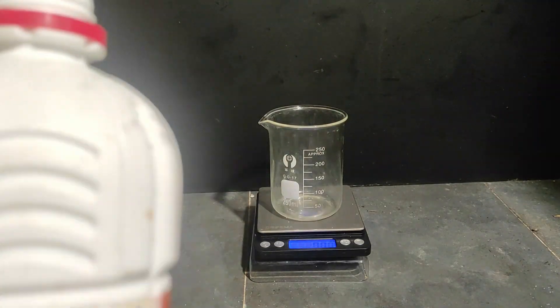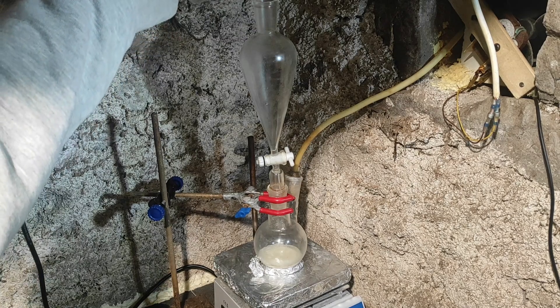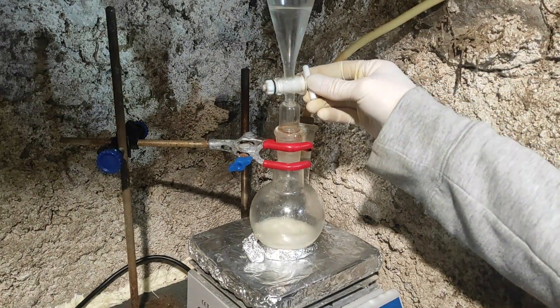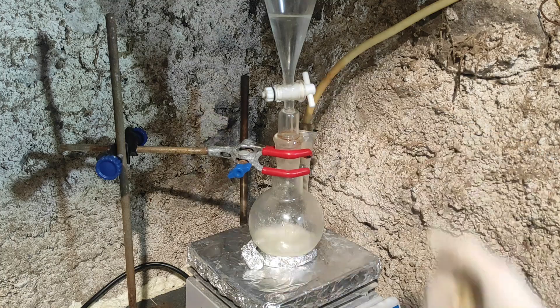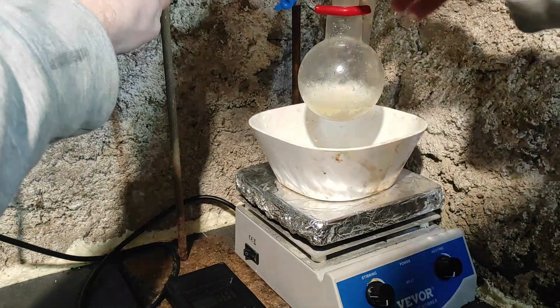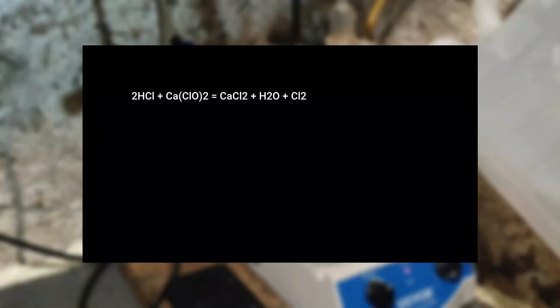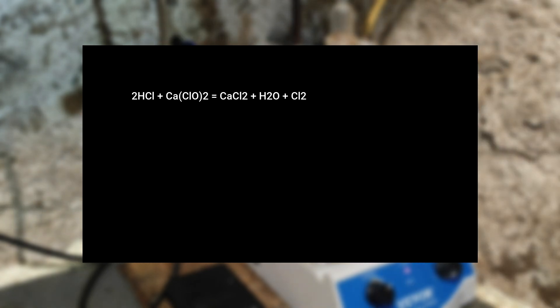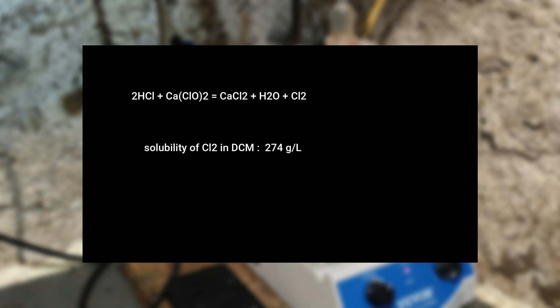I measured 27 g of 23% hydrochloric acid, then placed the flask on the hot plate and added the hydrochloric acid to the dropping funnel. I turned on the stirrer to mix everything well and started to add the hydrochloric acid slowly. I also added a cooling bath filled with 0-degree water to keep everything cold. When the hydrochloric acid drops into the styrene mix, it reacts with the hypochlorite to form chlorine gas and calcium chloride. The chlorine gas is not directly evolved though, because it dissolves in the mixture — and the reason we added dichloromethane is because it's very good at dissolving chlorine, so we lose less to the air and get a better yield.